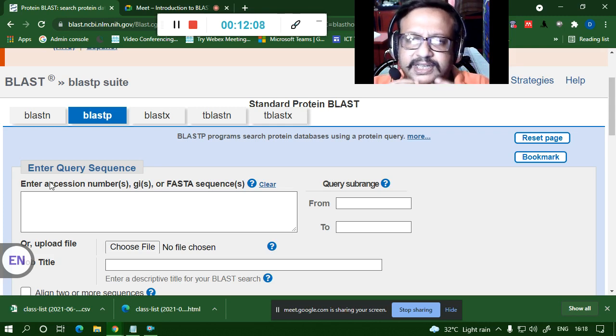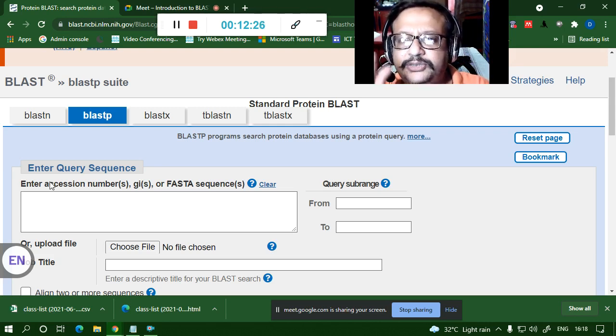So the first thing is you can search human HSF1, and then you'll see 101,000 sequences. Out of that you find human HSF1, and from there you copy out your accession number and keep it safely with you. Later, whenever you want to retrieve the sequence, use that accession number and search in this NCBI site itself, and you will find only the sequence which you need.